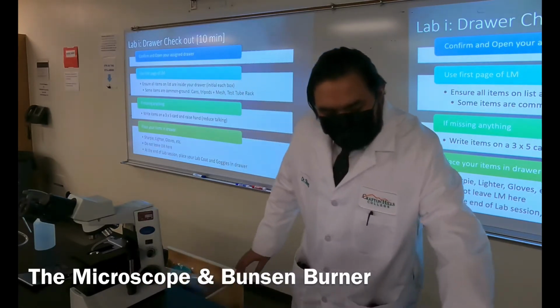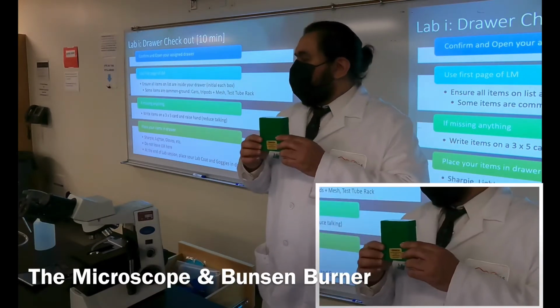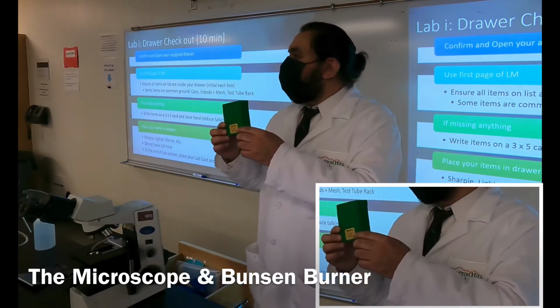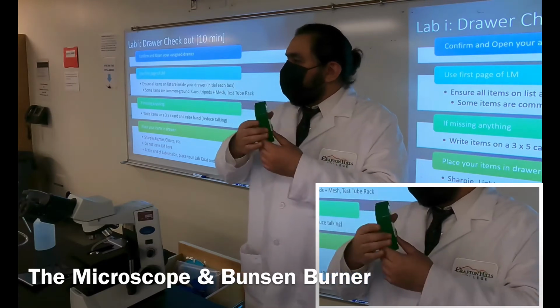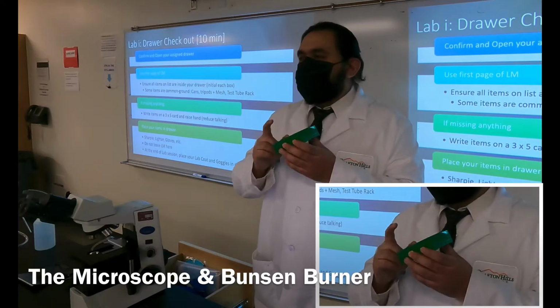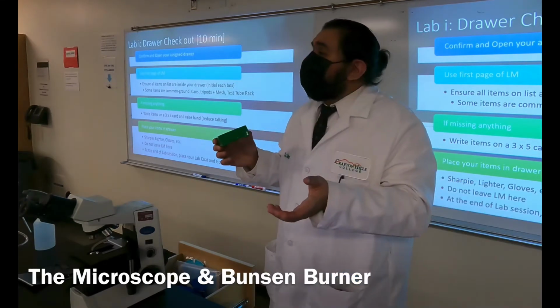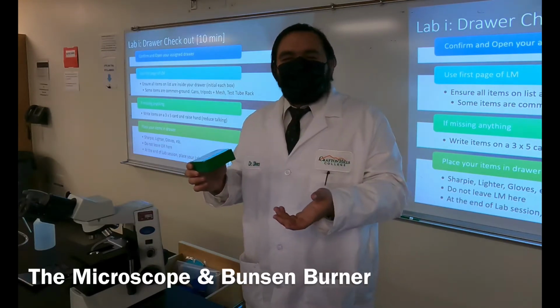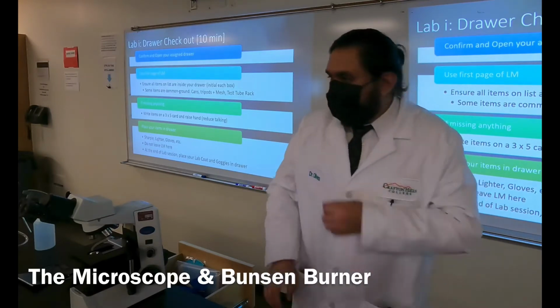Now, you should have a little slide box. Mine will definitely look different than yours. These plastic boxes will come in all sorts of cool colors. Blue, red, white, green, all the fancy colors. They might be a little bit bigger and a little bit smaller. So they should be empty. If they have some glass in there, dispose of it in a glass disposal. This is where we're going to transport all our slides today. And if you happen to bring the stuff that you did at home, you can even store them in there for later. Okay? We're going to use them next week, so we don't need them quite yet, but you can store them in there. Okay?